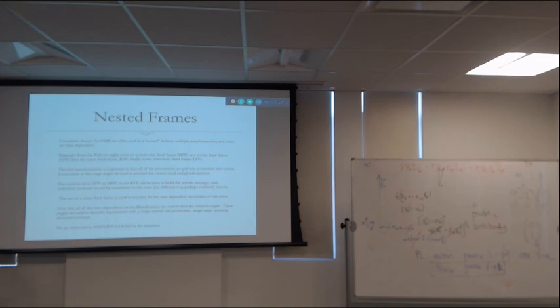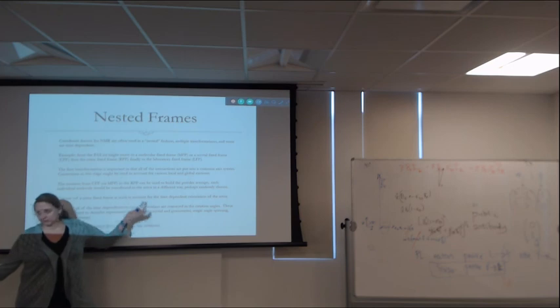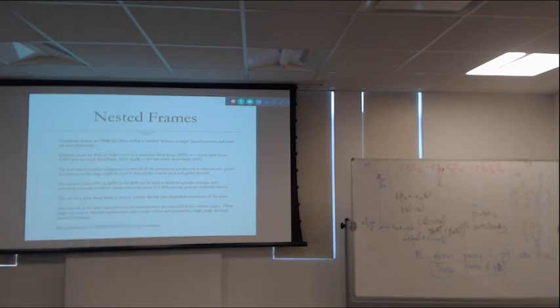And there'll be structural information if I can take a bunch of those functional groups and move them all to the same common axis through different angles. So I'll be saying this stuff in this alpha helix, it all has a beta value of 40. But down here in this sheet, most of these have a beta value of 20. That's structure. Get enough of those angles together, that's structure. So we take each functional group on its own, from its own PAS, and move it to a common frame. Maybe 100 of them or 200 of them going all the way through the protein.